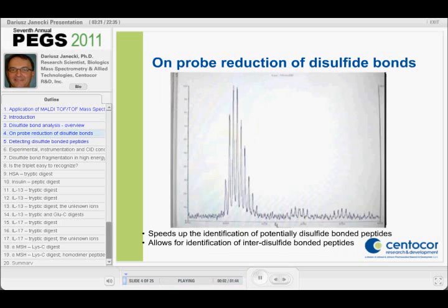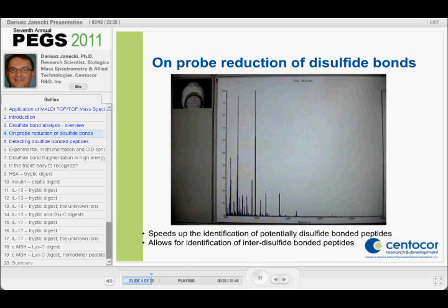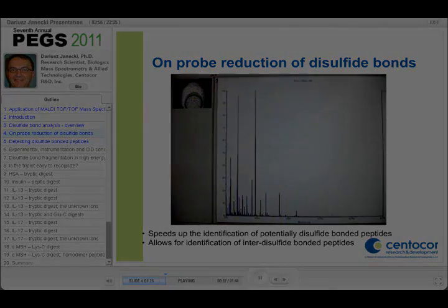I generally look at the MALDI mass spectrum and apply the reduction on probe to very quickly scan the MS window to see what peptides are actually being reduced and what is missing after the reduction on the MALDI probe. So the reaction is set up really quickly, and this is the tryptic digest of HSA on the probe, and you will see the two spots that were not reduced on the probe, and I specifically will show you this peak here, zoom on this area.